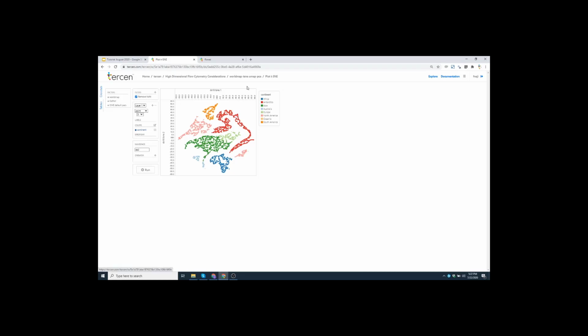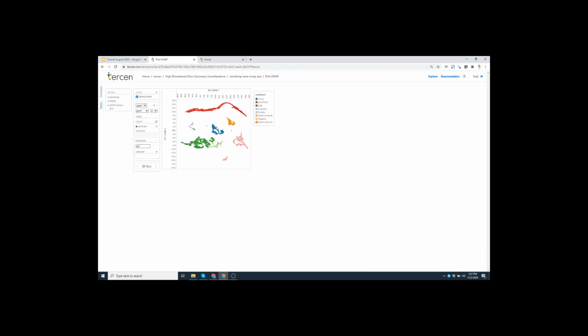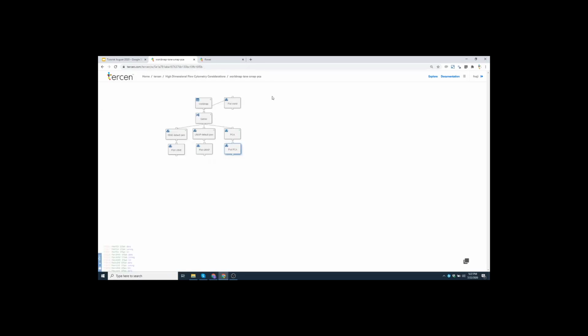Also, the shapes are slightly deformed. In UMAP, even though it's upside down, everything is in the right position. You see Antarctica, of course, is up in the top now, but everything else, North and South America, Africa, Eurasia, is right. So UMAP is much better in terms of keeping the global and local structures here. PCA, of course, is cheating because the problem is a linear problem. So that's how it looks.